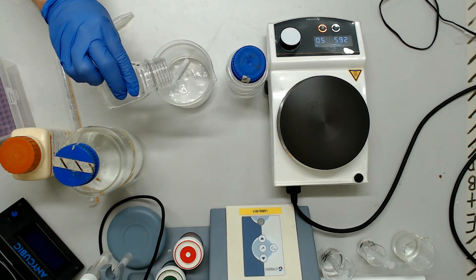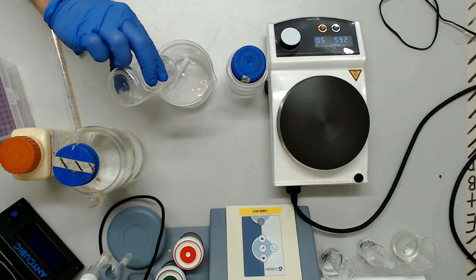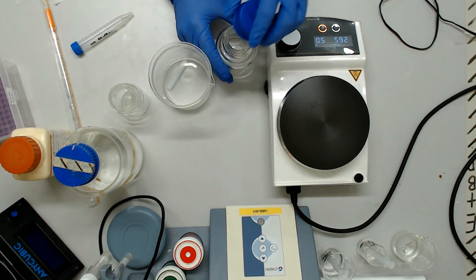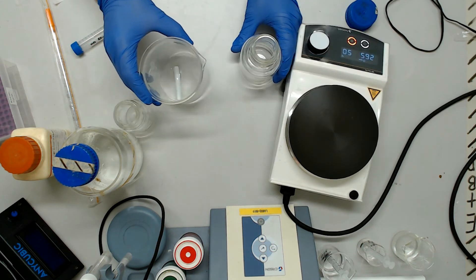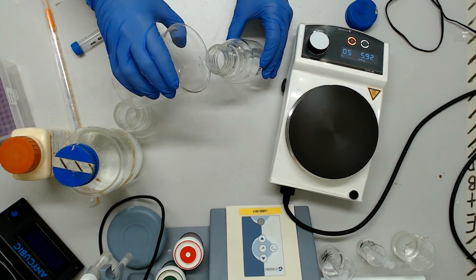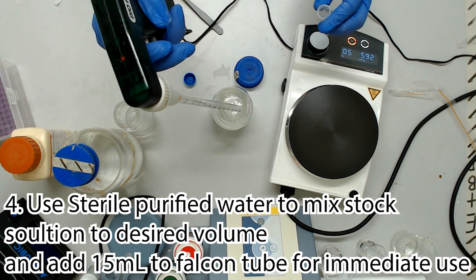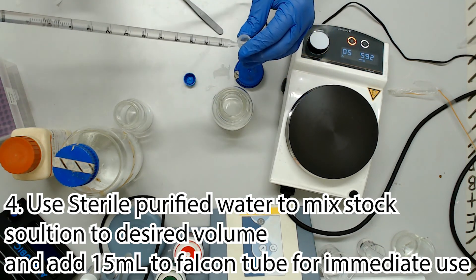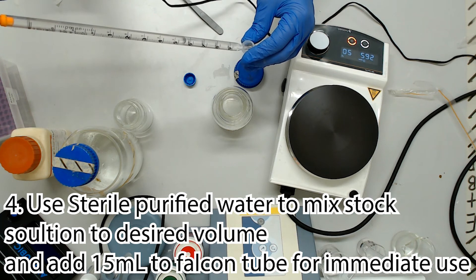I used to balance the pH of this buffer to 7.5, but word on the street is that this is an unnecessary or even unproductive step. I'll let you decide whether or not this is worthwhile, but skip it for mixing our own buffers for today. Finish by mixing your stock solution up to the final volume with sterile purified water, and don't forget to aliquot yourself 15 mils into a falcon tube for immediate use.